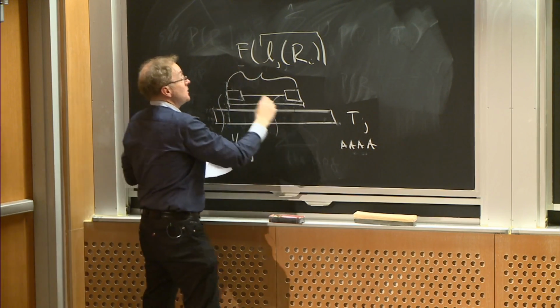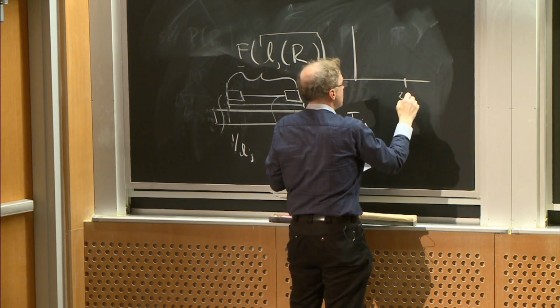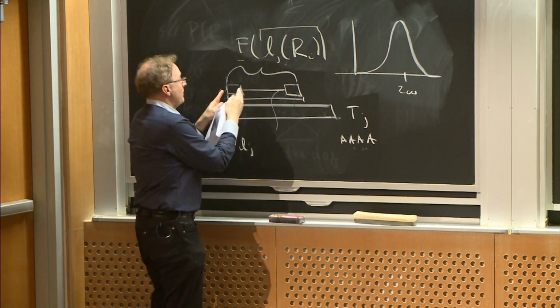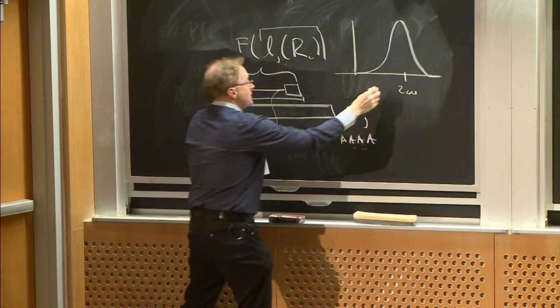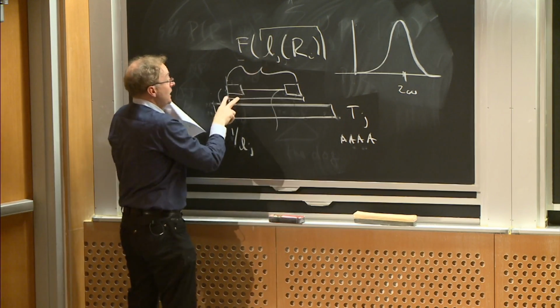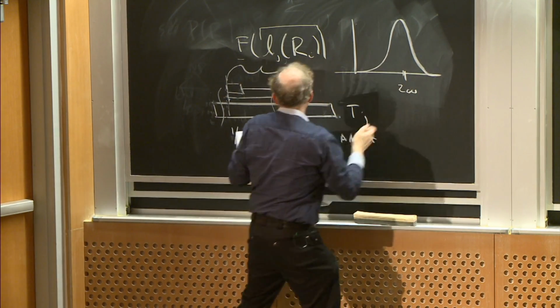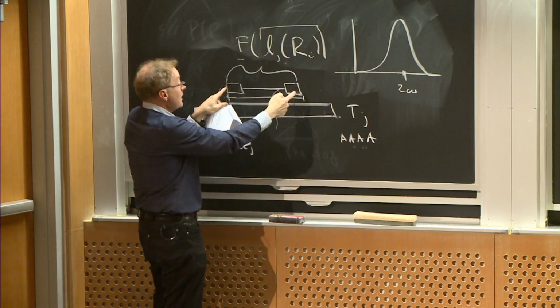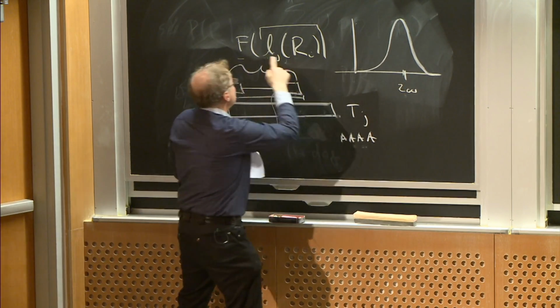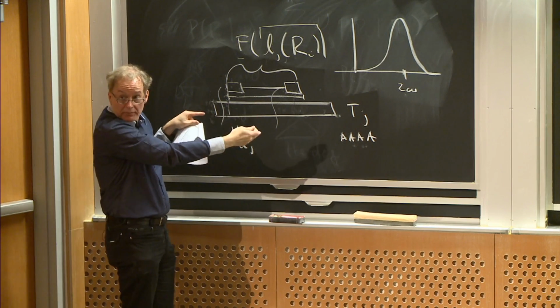F is going to be the probability distribution of the length of the fragments. So let's just say that they're centered around 200 bases. If this is exactly 200 bases, it's going to be quite likely. But imagine that when I map this fragment, this wound up being 400 bases apart. Then this distribution would tell us it's very unlikely that I would see a fragment that mapped here and mapped 400 bases up here, because my fragment length distribution defined by F is centered at 200 bases. So it's going to discount the probability of that.